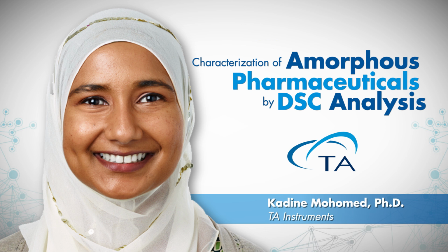But as you perform this melt transition, impurities will cause a melt point depression, as well as will change the onset slope as it leads into the melt peak. So this ASTM standard focuses on integrating the area of this peak, but also creating fractionated or partial areas in the analysis leading into the peak.